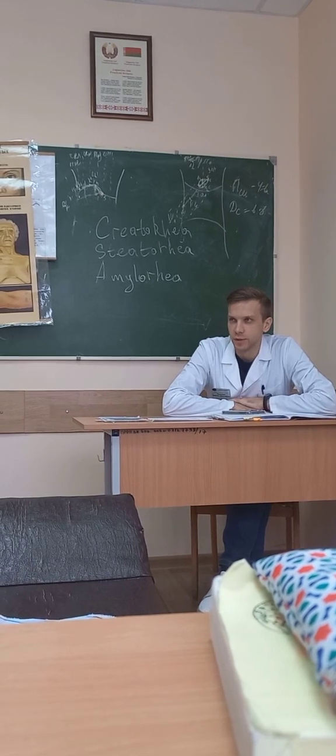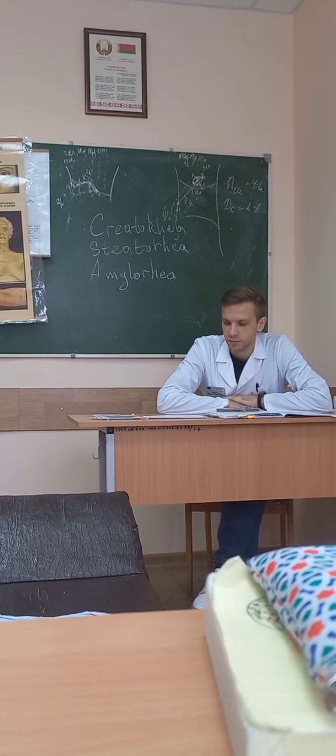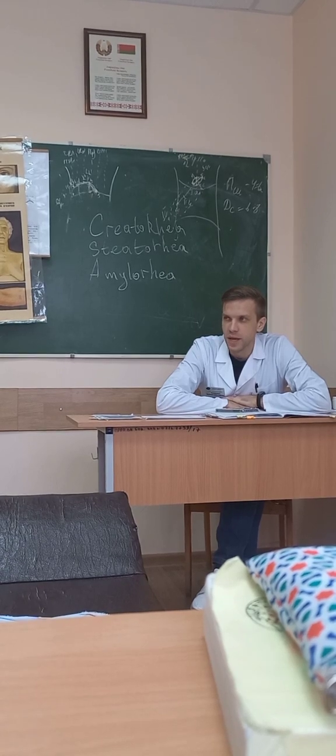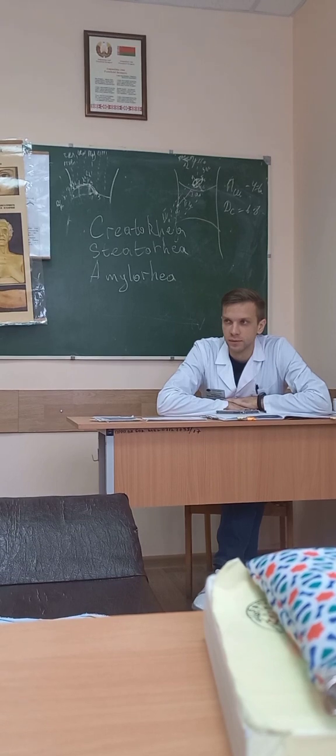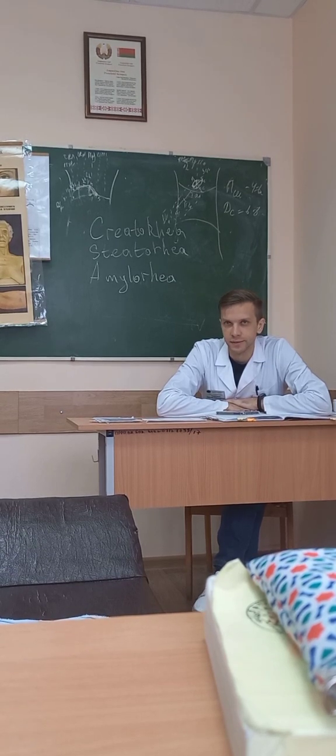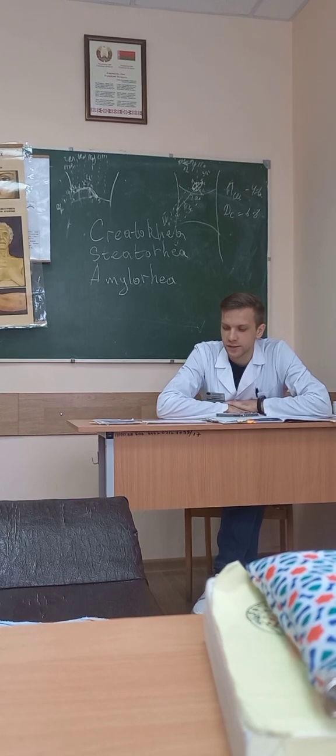We can see liquid or semi-liquid stool, shape is unformed, pH is acidic, smell is acidic, and there is amylorrhea.